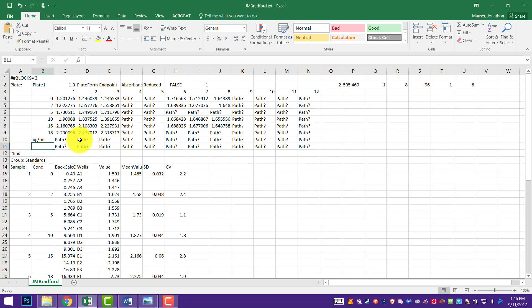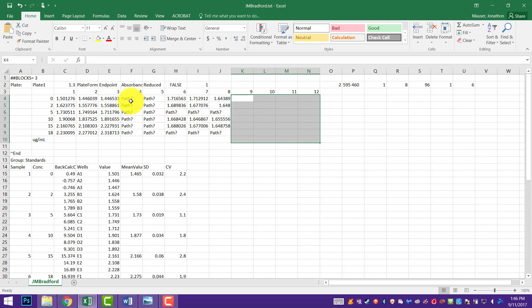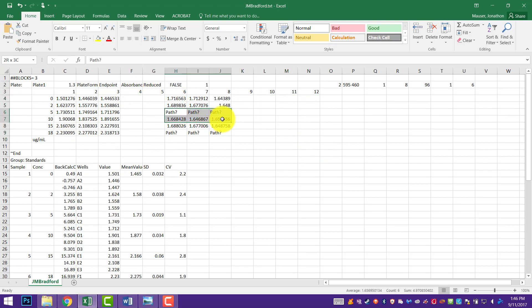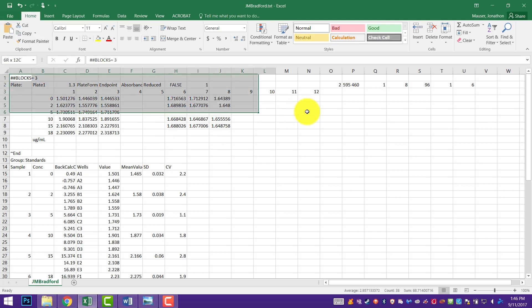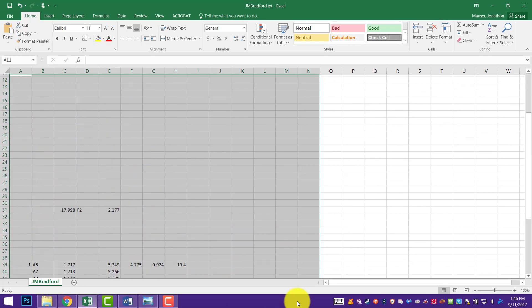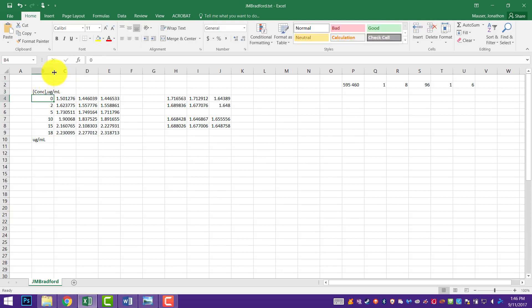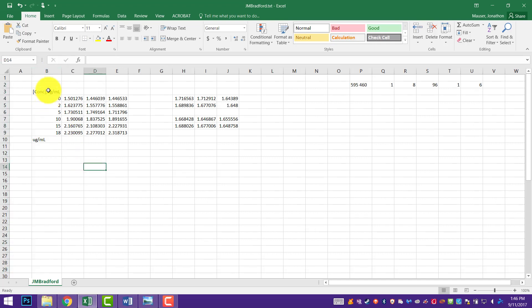I don't need this G stuff, so anything that says path in it we can clear out. I'm just cleaning it up so it's easier to see. I'm going to go ahead and call this the concentrations — micrograms per ml. You can double-click up here to expand it to match our stuff. You can see this is in triplicate. Now these guys are unknowns.